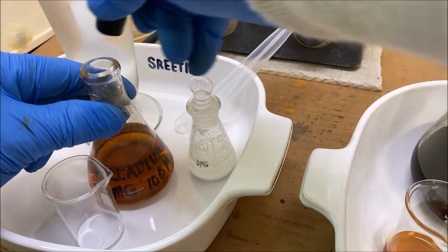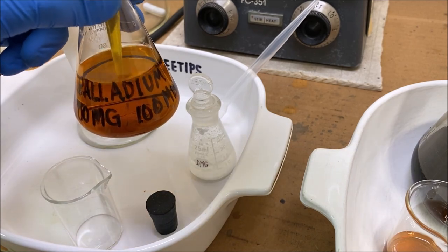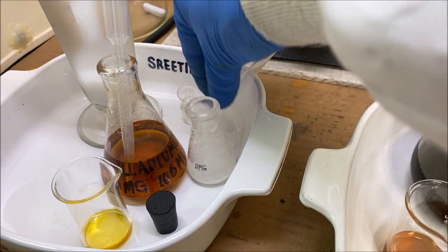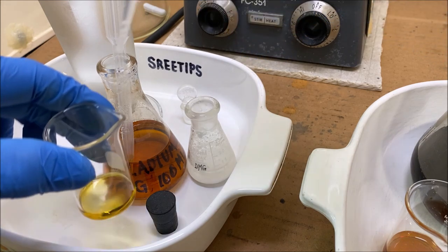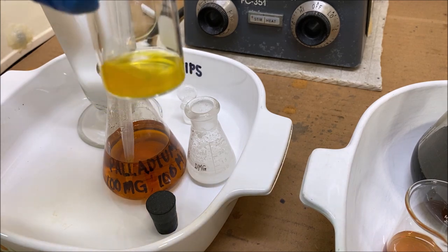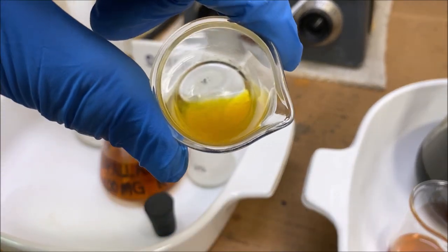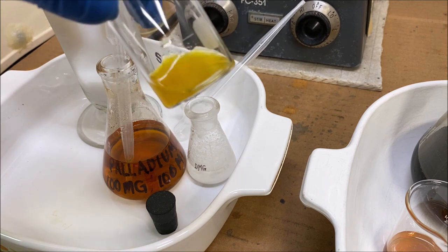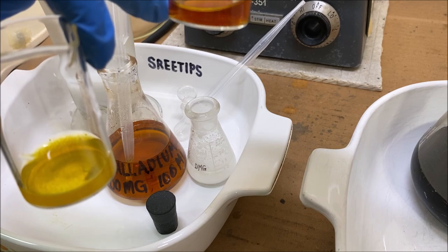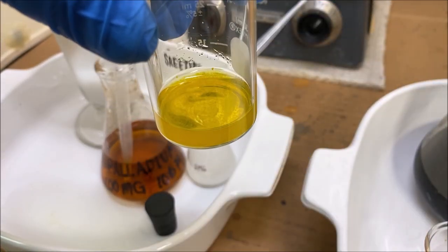To demonstrate what the palladium DMG reaction is supposed to look like, I've got some palladium solution here - a tenth of a gram in a hundred milliliters. I'm putting some in our beaker and adding a little DMG. You'll see it precipitates out a yellow palladium precipitate fairly quickly. There it is - see that precipitate forming? That's what the palladium reaction should look like. It's a very sensitive test for palladium in solution, as opposed to our platinum solution which has no palladium or only a trace amount.